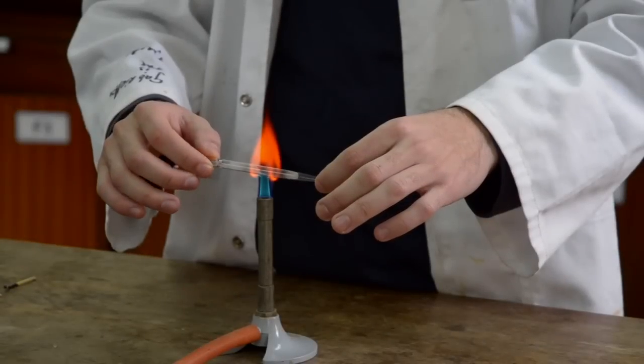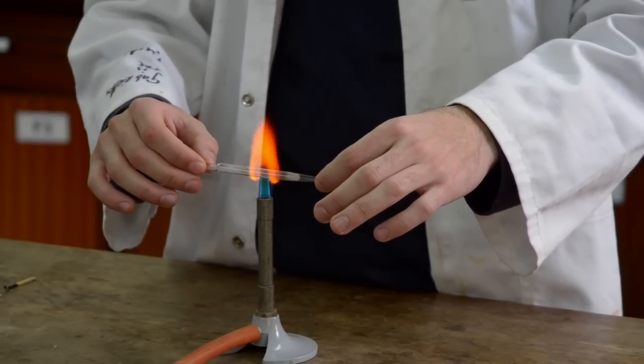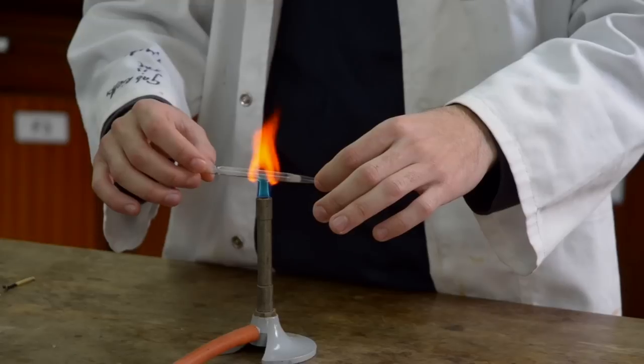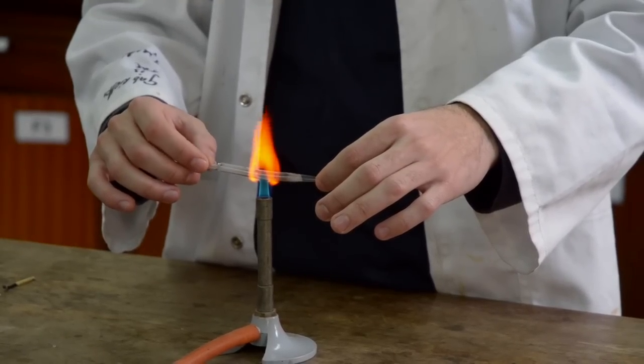Heat the middle of a pipette over a blue Bunsen flame. Hold the ends carefully as they will get hot. Using latex gloves is not ideal as they usually reduce your grip on the pipette.